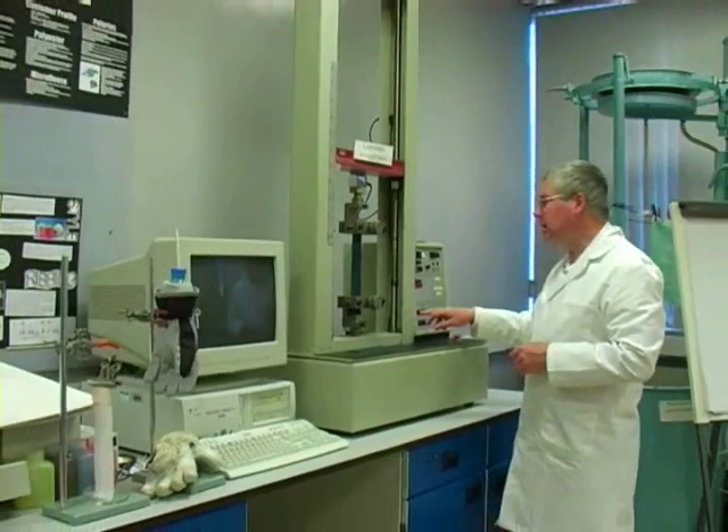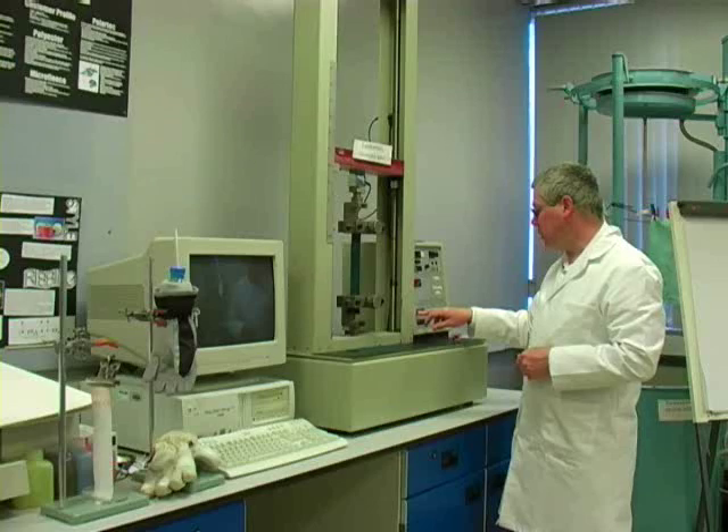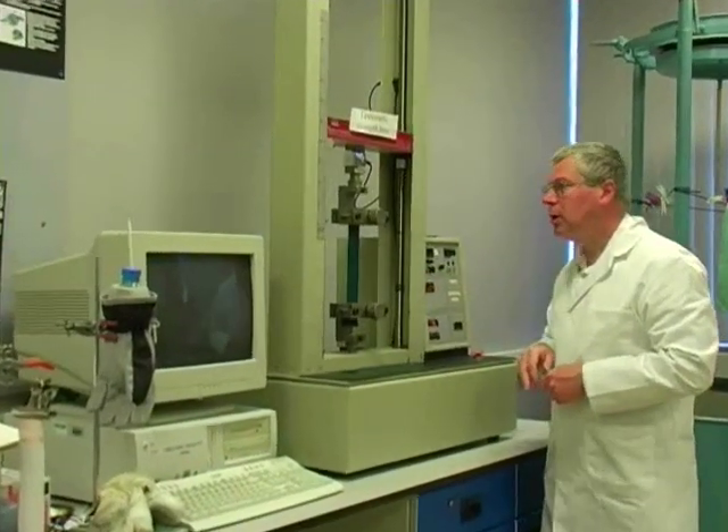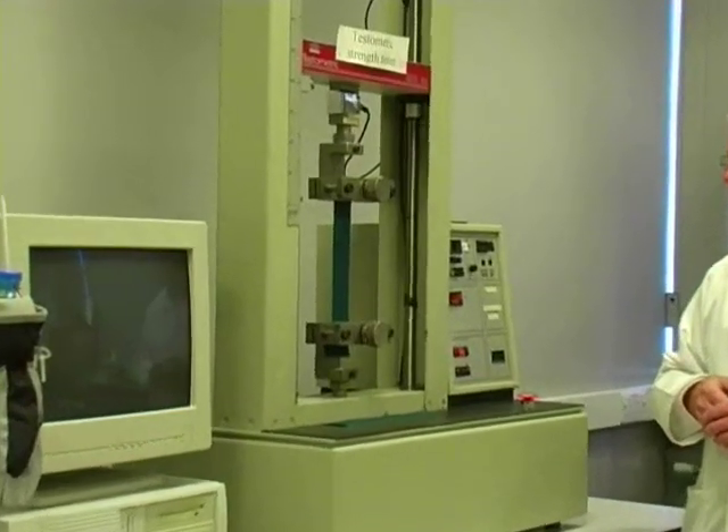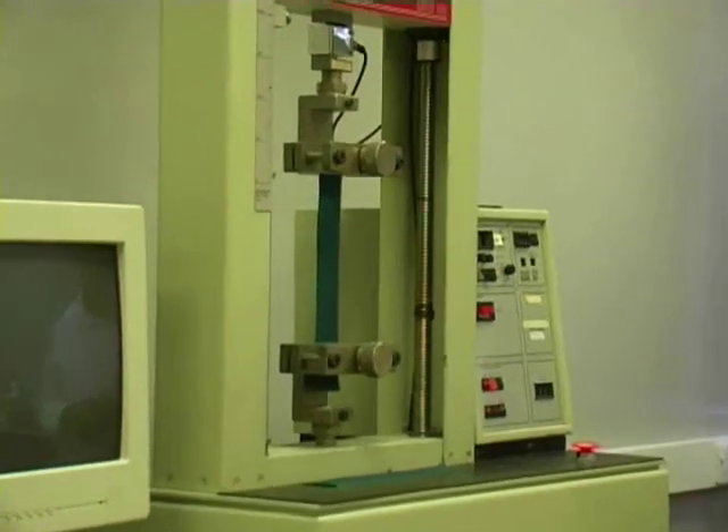And now I'm going to start the test by pressing strain, and peak hold. Peak hold will freeze the maximum force of the sample, which will be the force of break.